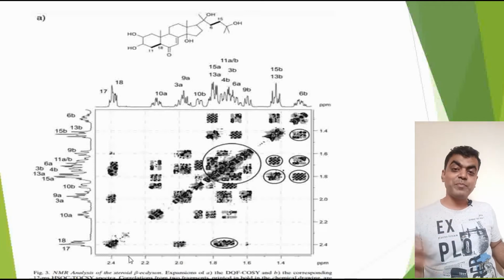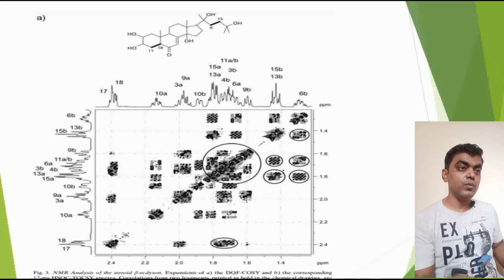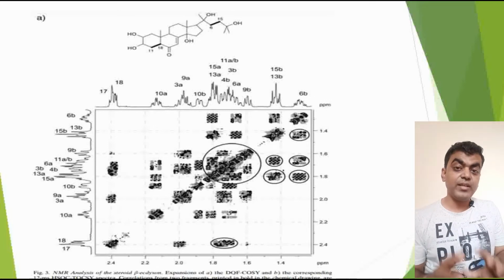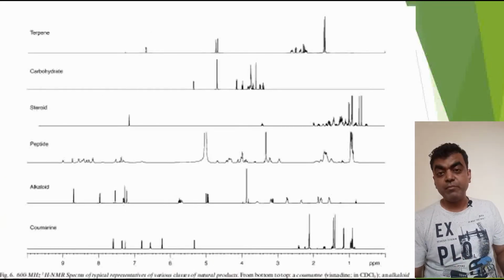When all the cross peaks match, only then do you know that you have actually assigned it, or that what the spectra are telling and what you are deciphering go hand in hand. Otherwise you will simply be saying something that may not actually be the case.